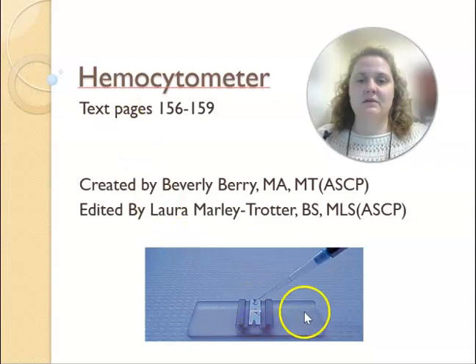If you'll look down at the bottom of the page, this is what a hemocytometer, or one design of a hemocytometer, looks like. And we'll be using the hemocytometer on the microscope to count cells.